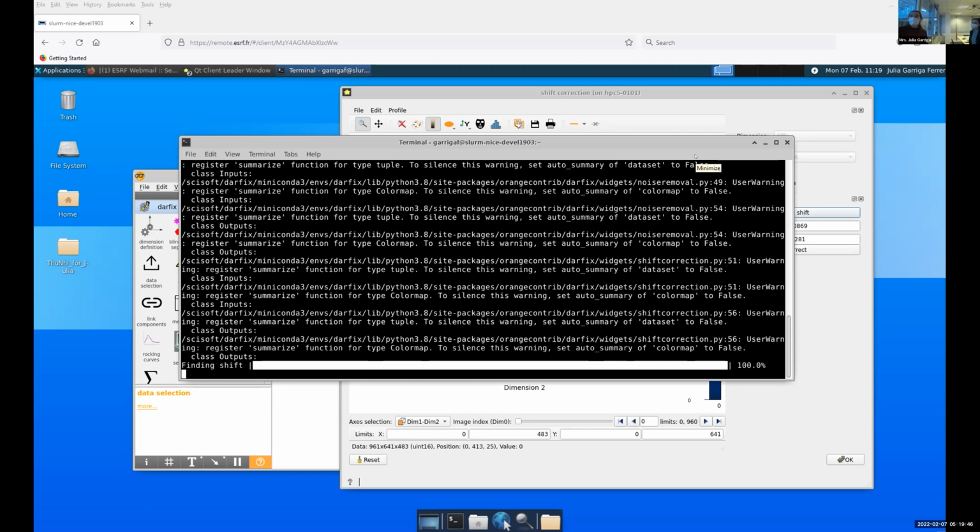Yes, exactly. Because he has a very old version of Darfix, maybe from the beginning of last year or maybe last year. I mean, I didn't even know that version of Darfix. So maybe it's beginning of last year. So maybe it's because of that.